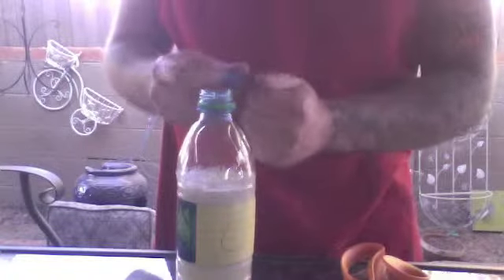Recap, shake vigorously. And put the balloon on, making sure it's all empty of air. Okay, so that's it for the controls. Now I'm going to show you how we're going to do it for the actual test solutions.